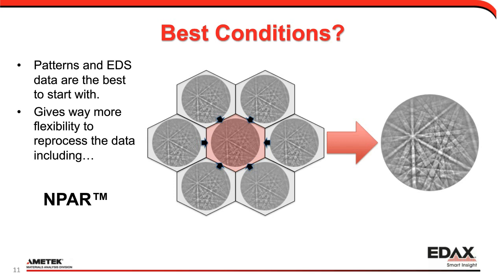And that gives me that ability, especially in geological samples or ceramic multi-phase samples, to say, okay, I have this chemistry, and maybe a poor diffracting material. I can increase my signal-to-noise ratio with NPAR, and I can use Chl-Scan combined with that to filter by chemistry. I've seen miraculous data sets where it's like I have no real data, to this is publishable data in a journal just by pushing a couple of buttons. And again, that's why I think it's always best to have both the EDS data and the patterns.